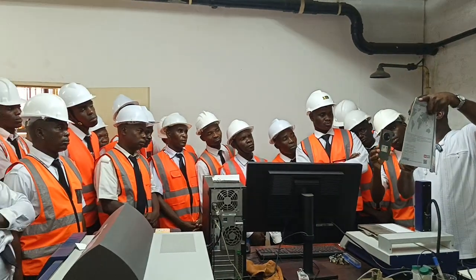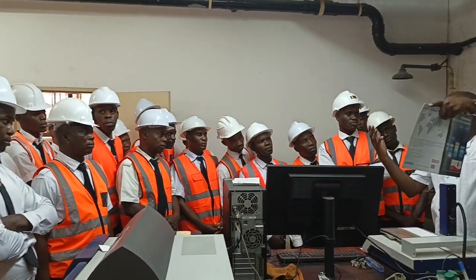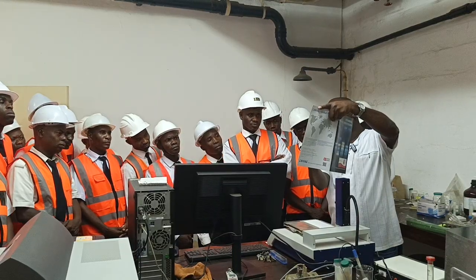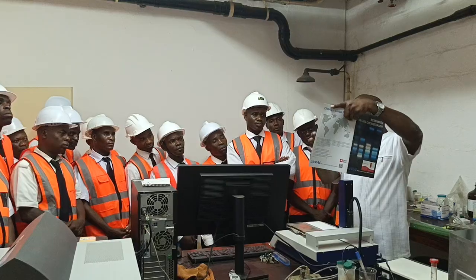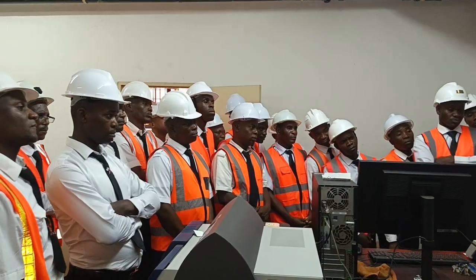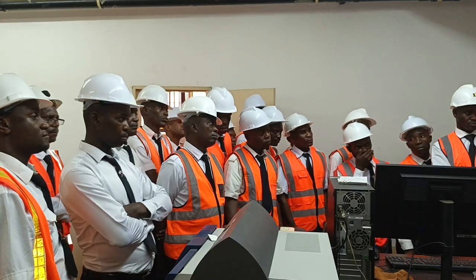We are able to see them in the dark, in UV, and under normal light, like where we are. So certain things that we're not able to see here will be seen in the dark, and so on and so forth. So this is how you see the components. They spotted so many compounds there, 1, 2, 3, 4, 5, but they are going in line. That's what it's about.